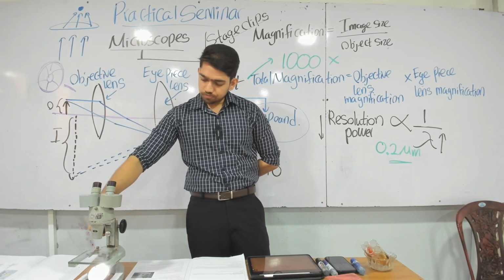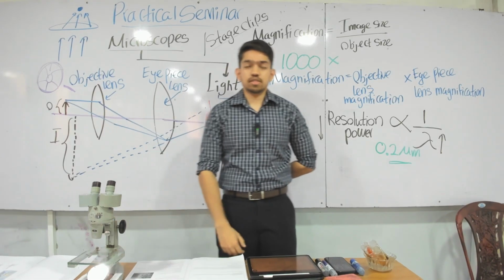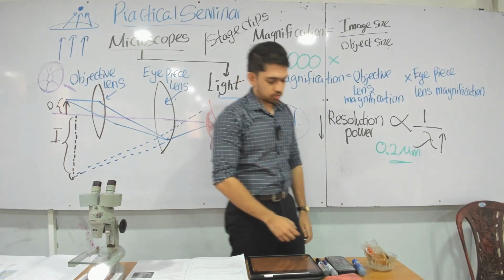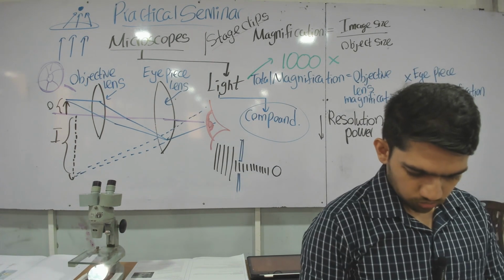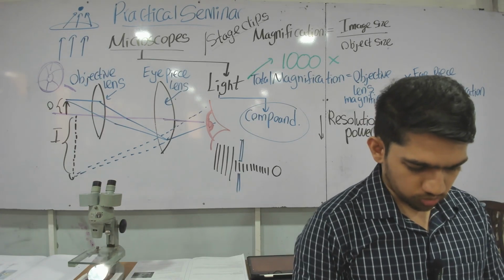You can say moves the lenses large distances for rough focusing.